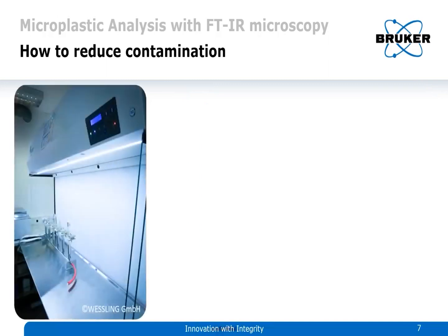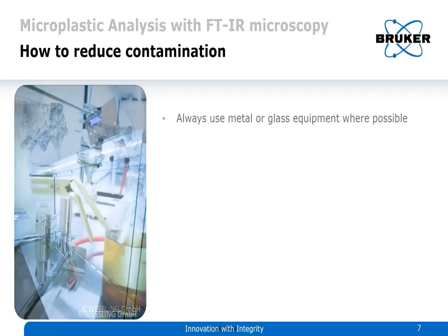So this is what a setup could look like. This image was taken at Wessling, a contract lab with a lot of expertise in microplastic analysis and also some Bruker equipment.